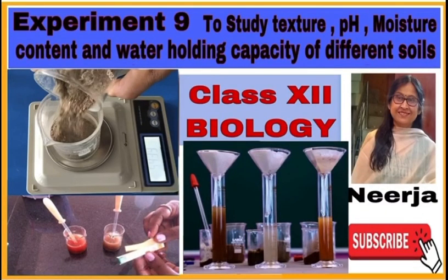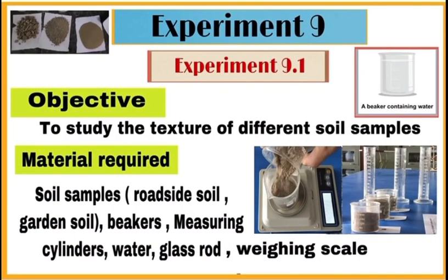Hello students, this is experiment number 9 to study texture, pH, moisture content and water holding capacity of different soils. Here I have divided the whole experiment into 4 parts. The first part is 9.1. Its objective is to study the texture of different soil samples.